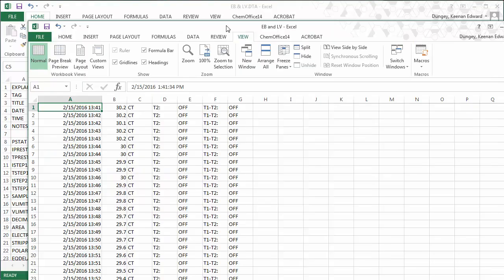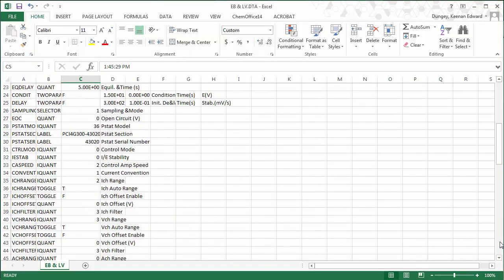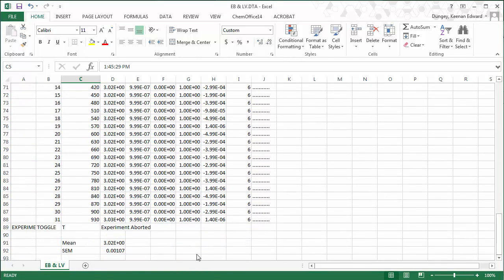So this must be the temperature data that we want. And what we can do is the same calculation. Actually, let's go ahead and copy that so I don't have to keep typing out the calculation here, since Excel doesn't have a standard error calculation.